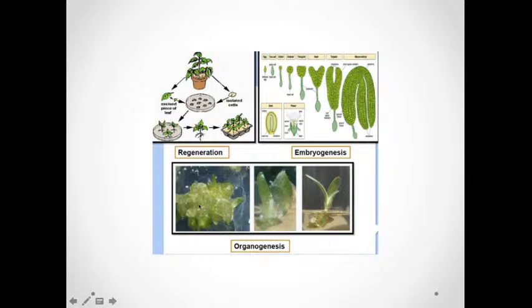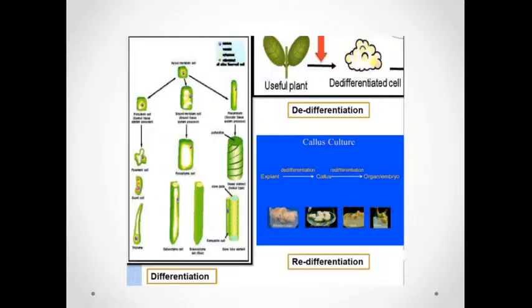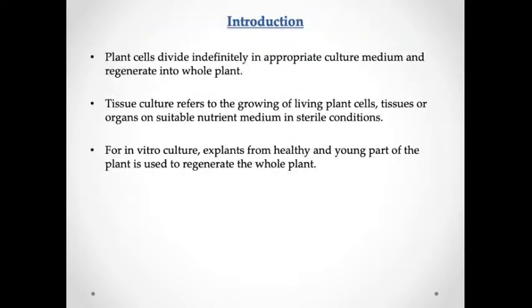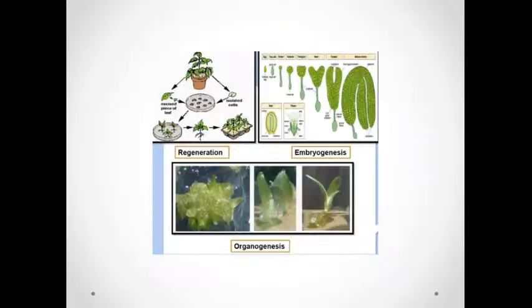And this is organogenesis, started from your callus. From callus, the shoots start to form. Then from the shoots, the roots form. So various organs are produced with the help of organogenesis. So that was a summary of what we did so far in a nutshell in the last 2 days within these 3 or 4 slides.